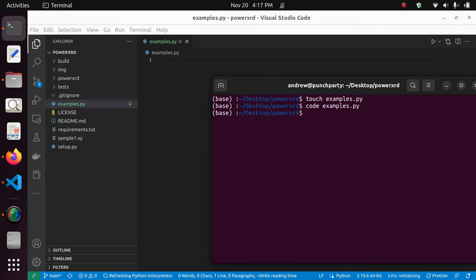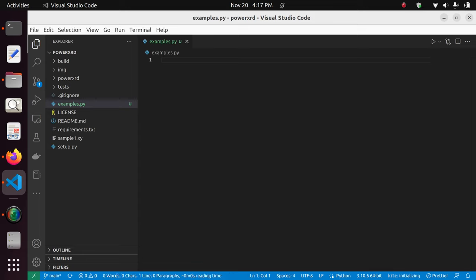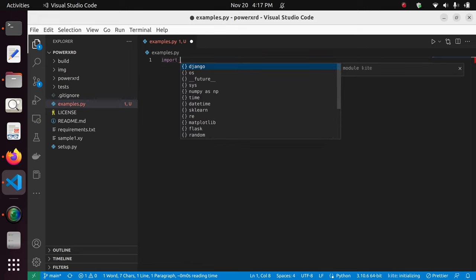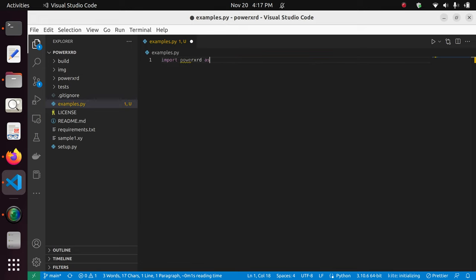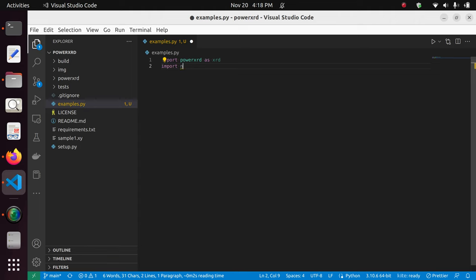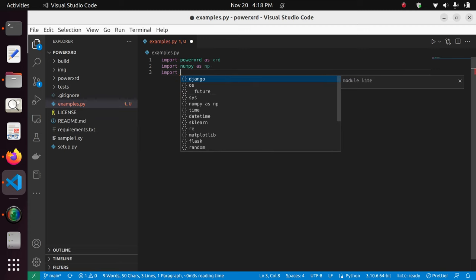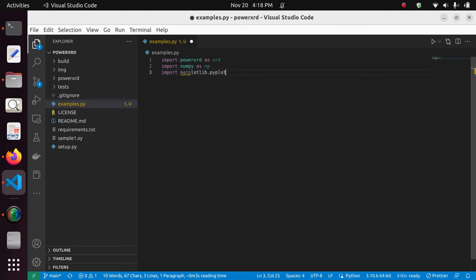We start with importing PowerXRD and giving it the alias XRD. We'll also be using NumPy with alias np, and we'll do some plotting, so we import matplotlib.pyplot with alias plt. That's basically what you'll start with.